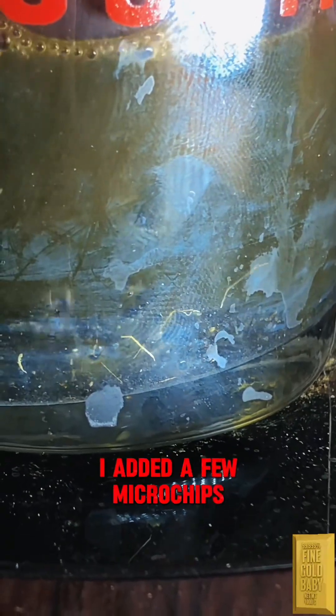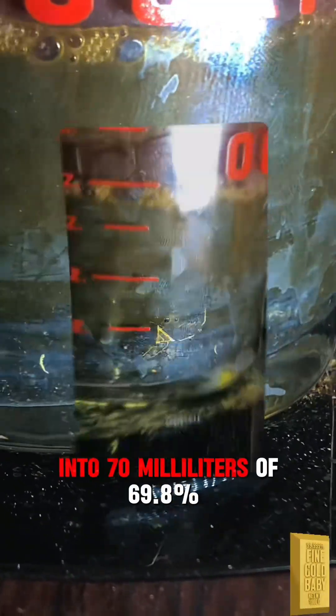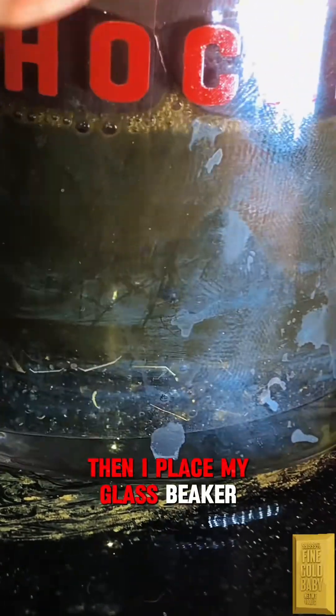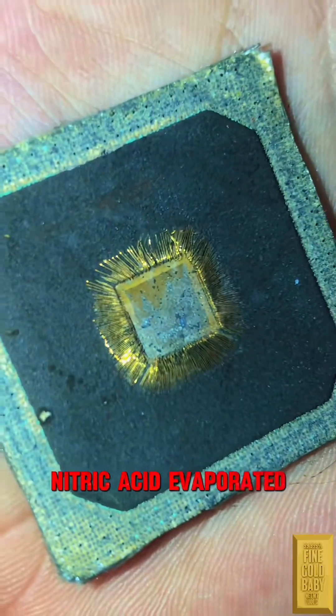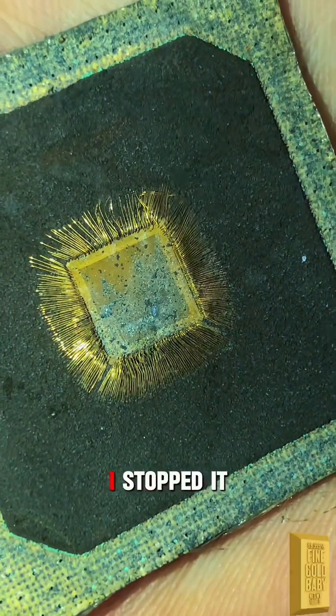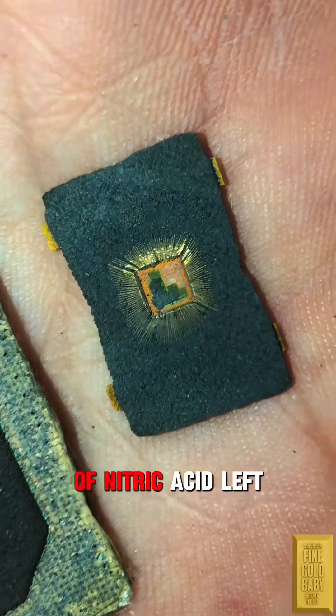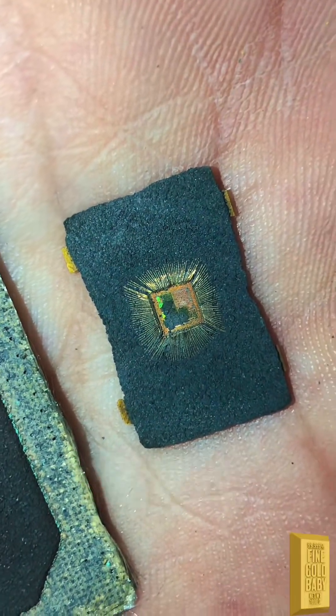I added a few microchips into 70 milliliters of 69.8% nitric acid, then placed my glass beaker onto a warmer at 185 degrees Fahrenheit. Every hour, about 10 milliliters of nitric acid evaporated. After three hours I stopped, leaving me with only 40 milliliters of nitric acid left. This is the wrong way.